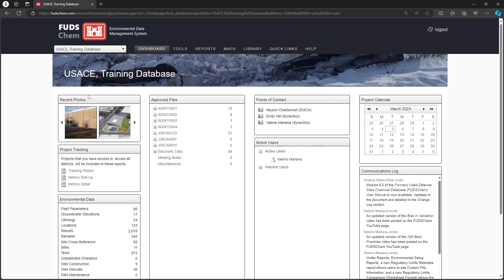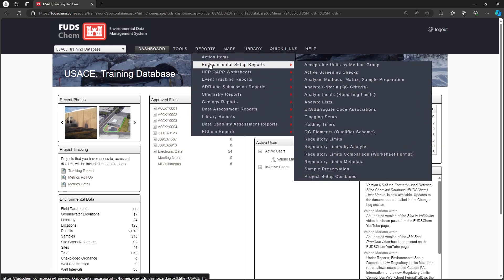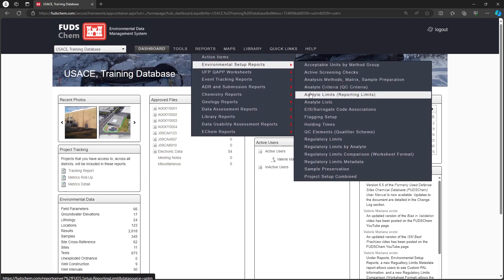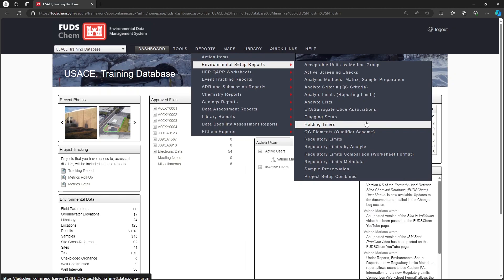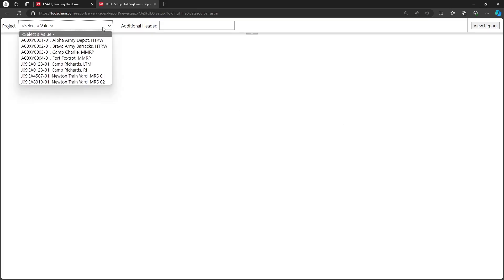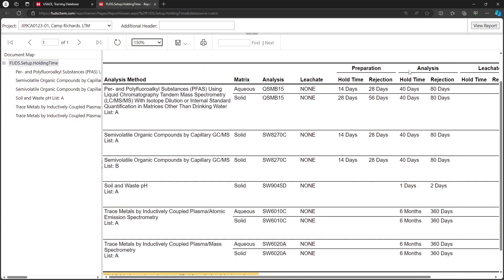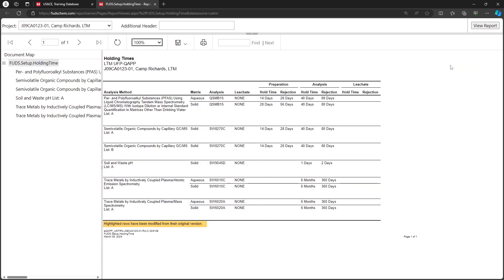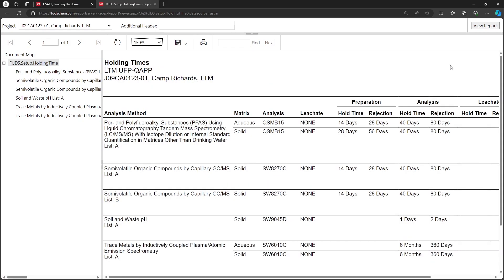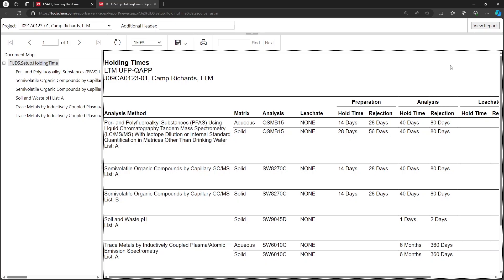Go to Reports, Environmental Setup Reports. Choose Holding Times, choose the project, then click View Report. This report lists the holding times established in the Holding Times tab of the EQAP. It includes holding times at the Preparation, Analysis, and Leachate levels. Values that have been changed from the original template are highlighted.